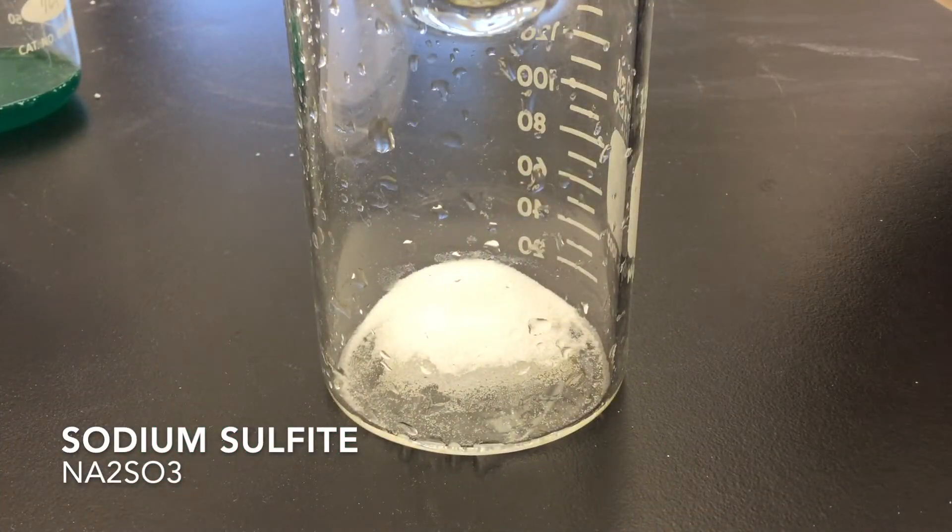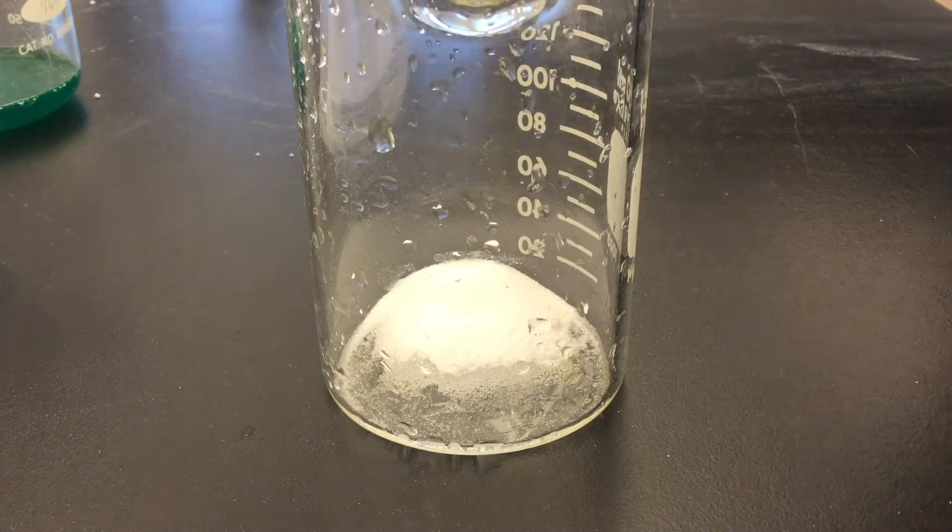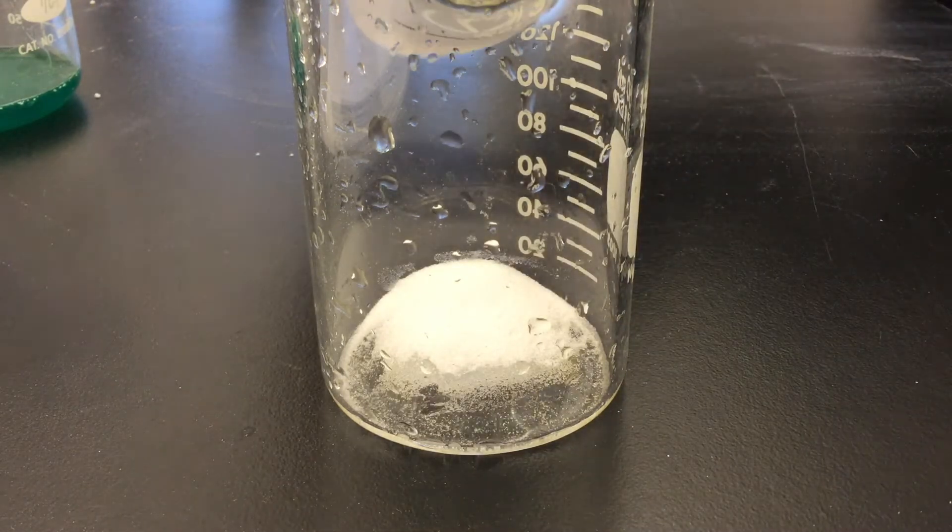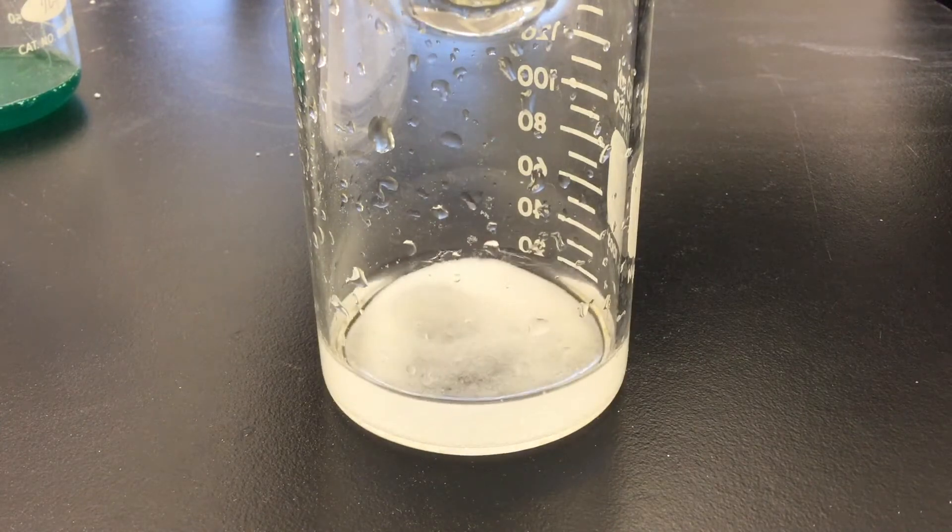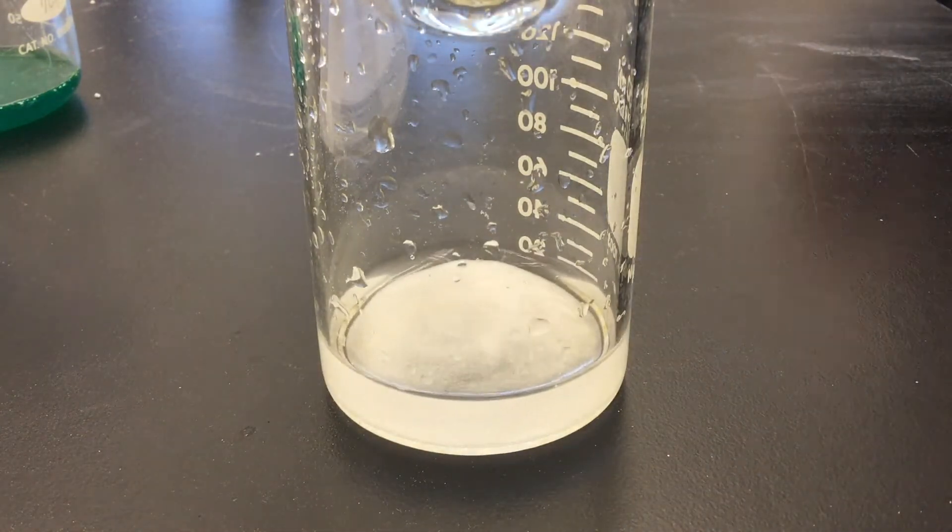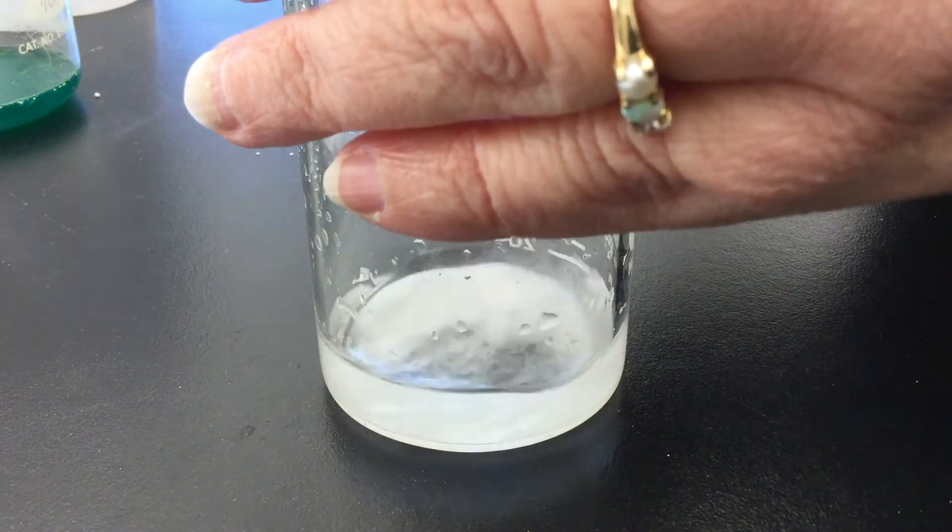You should have determined ahead of time what the stoichiometric amount of sodium sulfite would be. You are going to use approximately twice this, but no more than twice. You're going to add about 25 to 30 milliliters of water and again stir until it completely dissolves.